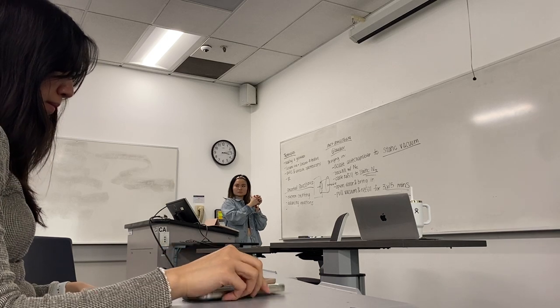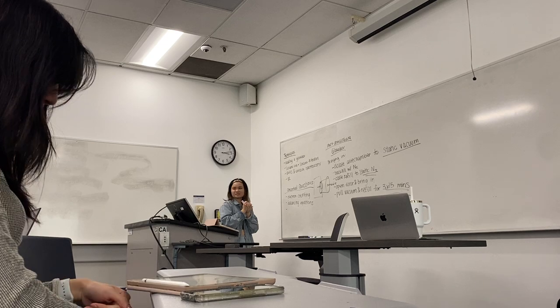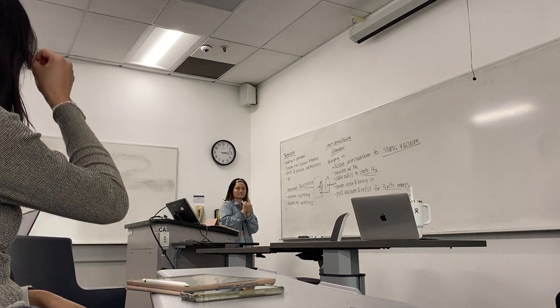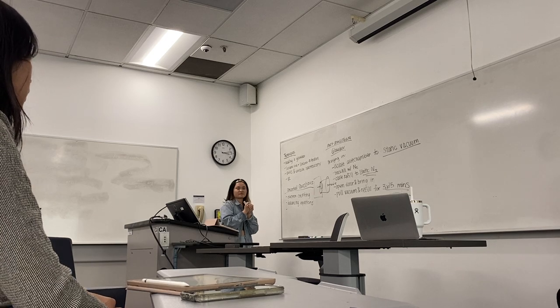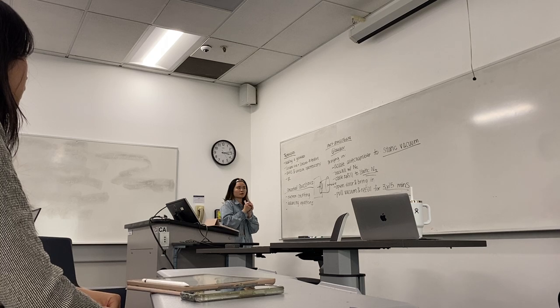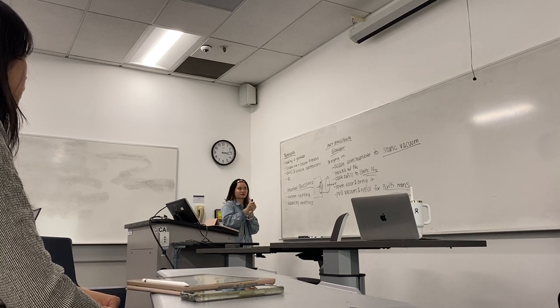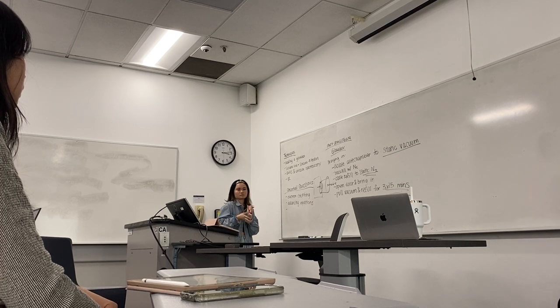When you say door, are you talking about the exterior or interior door? Exterior. Okay. And then after the 3 by 15, it's the same process, and you just bring it in. Where you isolate to static vacuum, backfill, static nitrogen, bring it in. Okay. Got it, very good.